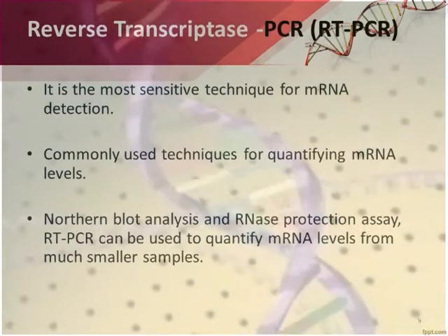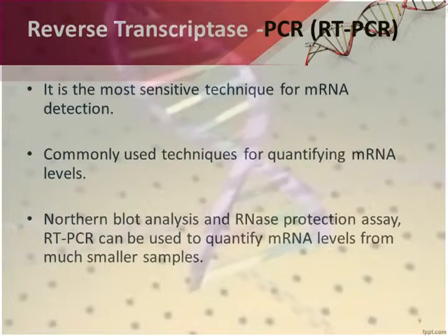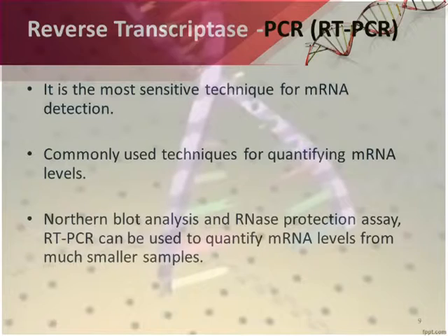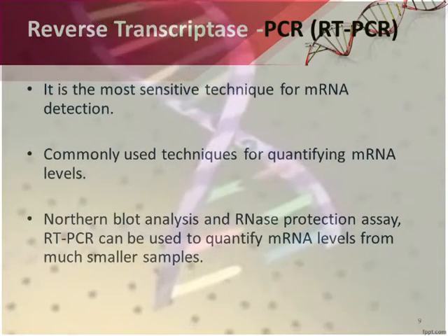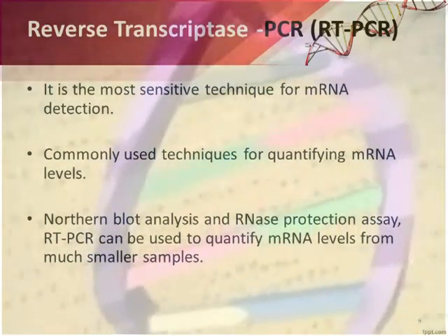RT-PCR. It is the most sensitive technique for mRNA detection. Commonly used techniques for quantifying mRNA levels are Northern blot analysis and RNase protection assay, and RT-PCR can be used to quantify mRNA levels from much smaller samples.